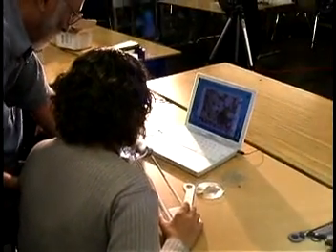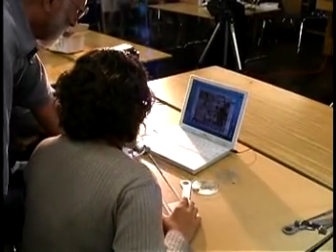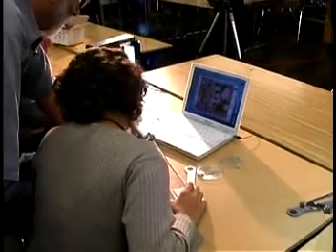The reason why is you want a top view of the sample. You need a good light source. And you basically want to look at color. You want to look at texture. Is it smooth? Is it dimpled? Is it rough? Those tell us something. Is it dull? Is it shiny? Is it translucent? We'll be able to see those factors with our handheld microscope looking directly at it.